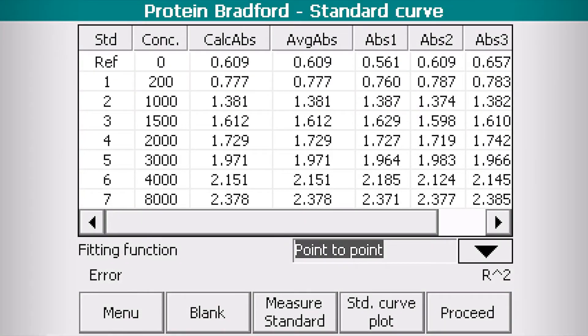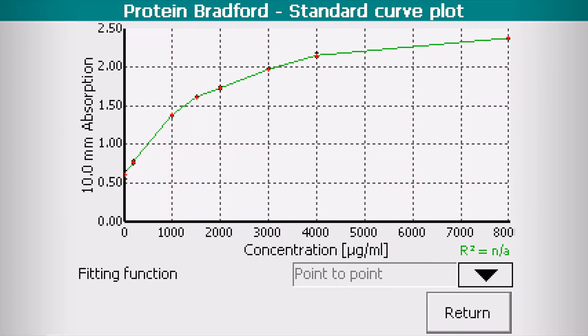Review your standard measurements. Click the Standard Curve Plot button to see the standard curve.